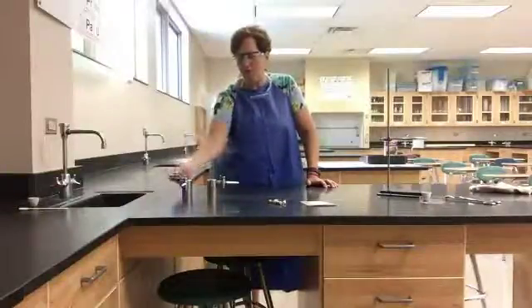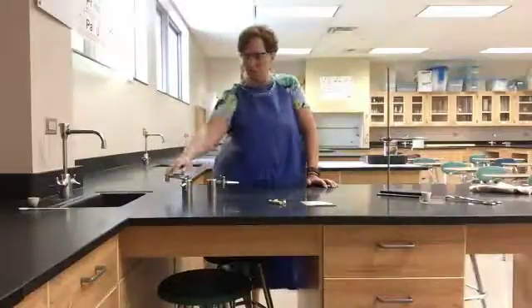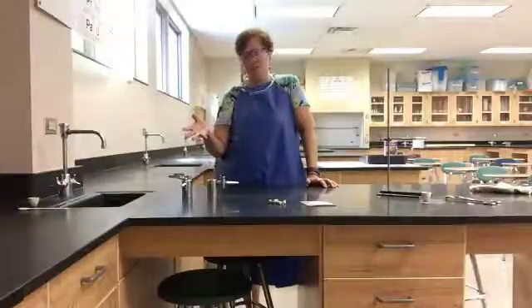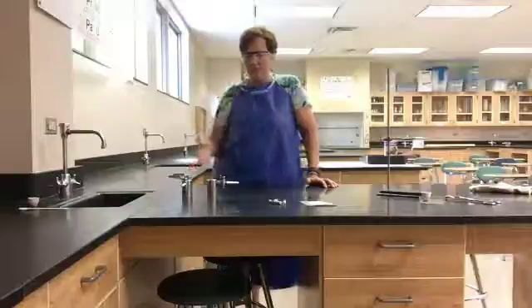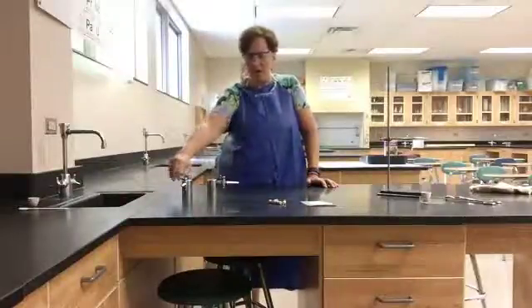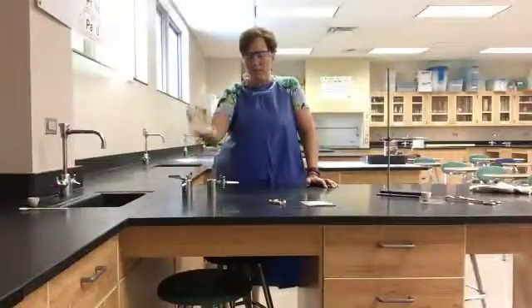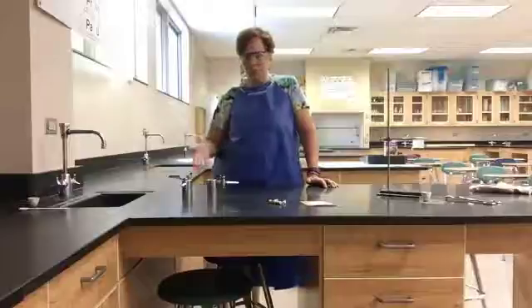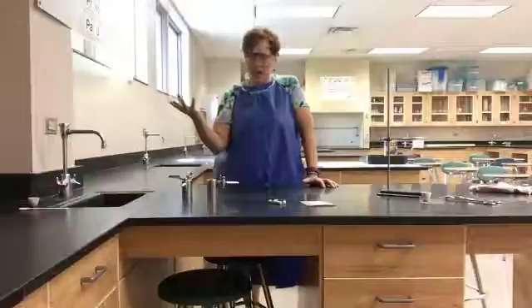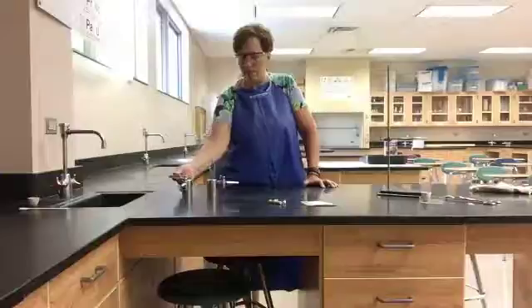What you never want to do is play with these during class and leave them on. If I turn the gas main on at the front panel and then forget to turn it off at the end of class, gas continues to flow through the room. If you've left the bench valve open, the room will fill with flammable gas — and all you need is a spark. We don't want that to happen, so we always leave them closed until we are ready to light the fire.